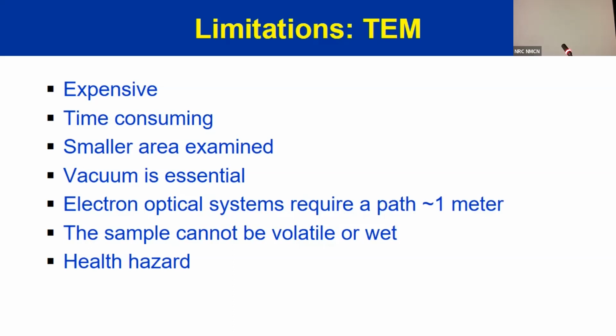So nowadays, if you look at the practical medicine part of it, most of the applications in the diagnostic field are in nephrology, and the other area is sometimes in liver, but not so important. Rarely in liver, one or two indications. Other would be skin and muscle, because you want to look at those adherent junctions between the keratinocytes, between the collagen. But that also is now relatively less used because you have different immunohistochemical markers and other techniques which can help you in making the diagnosis.